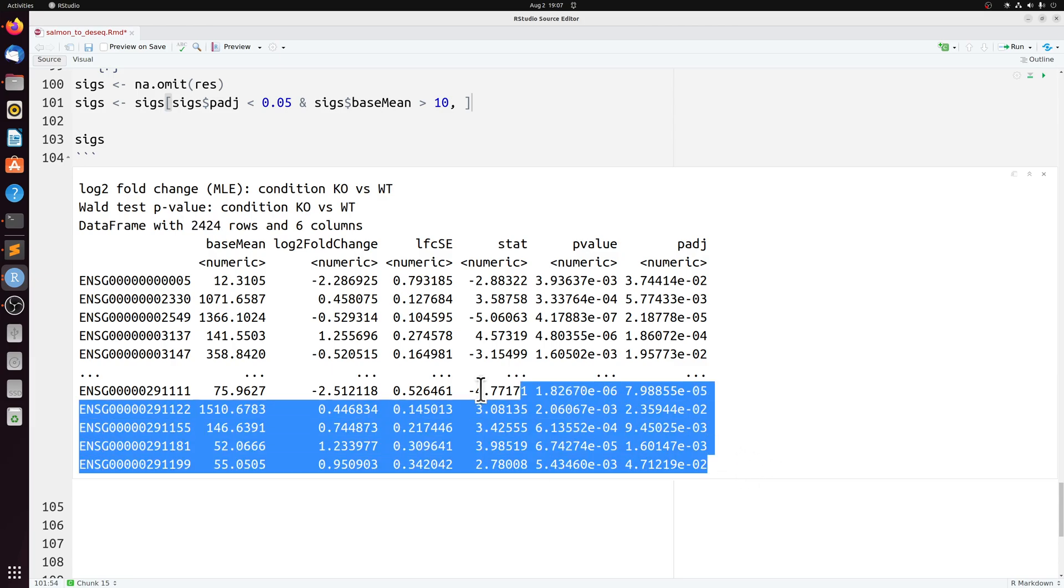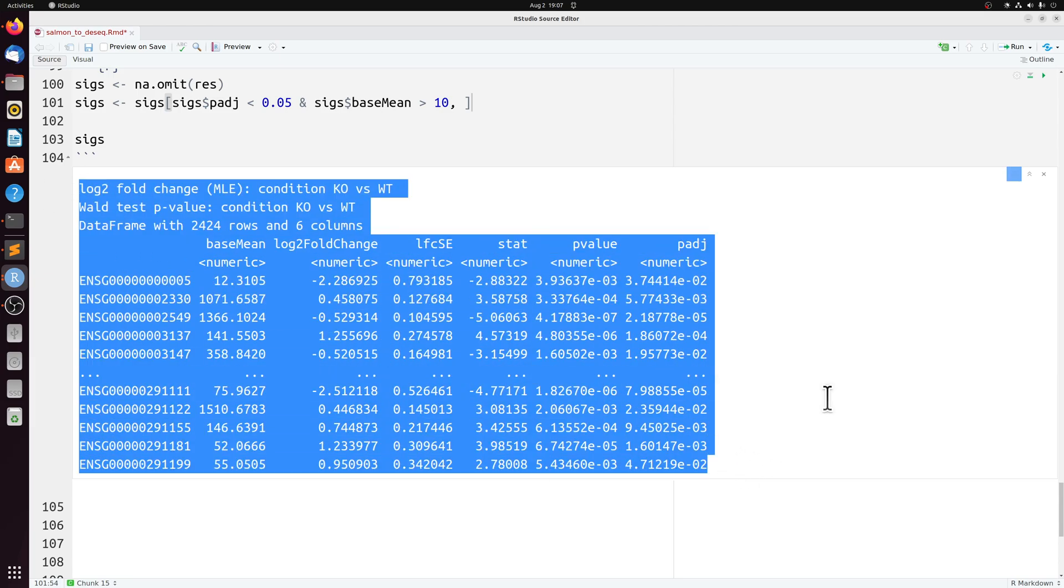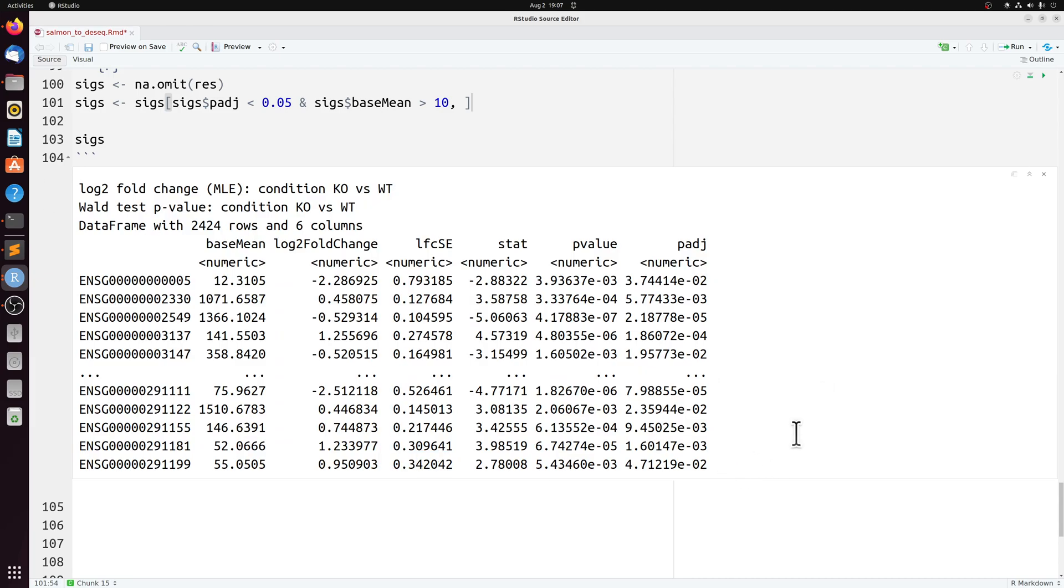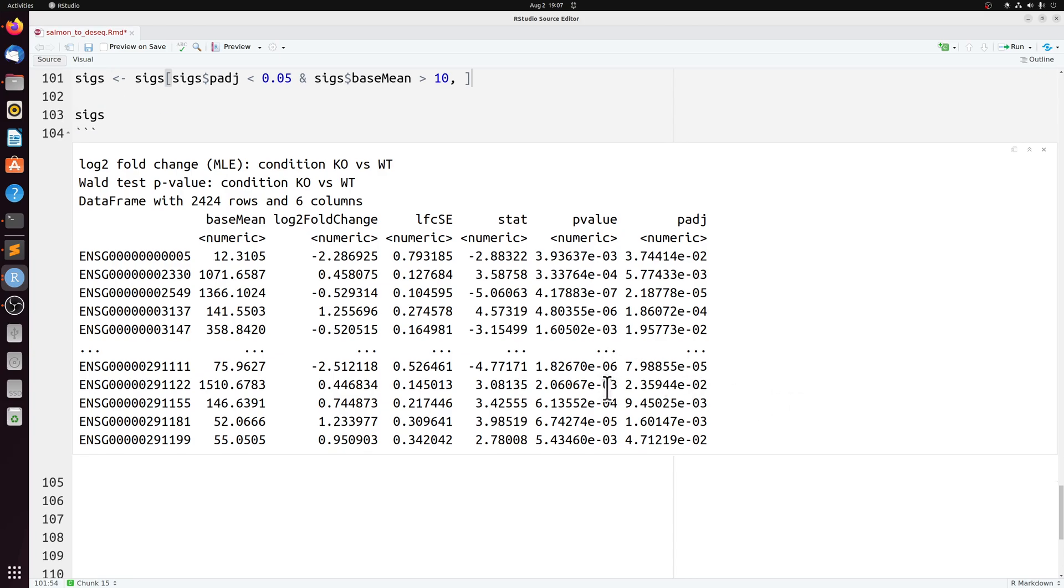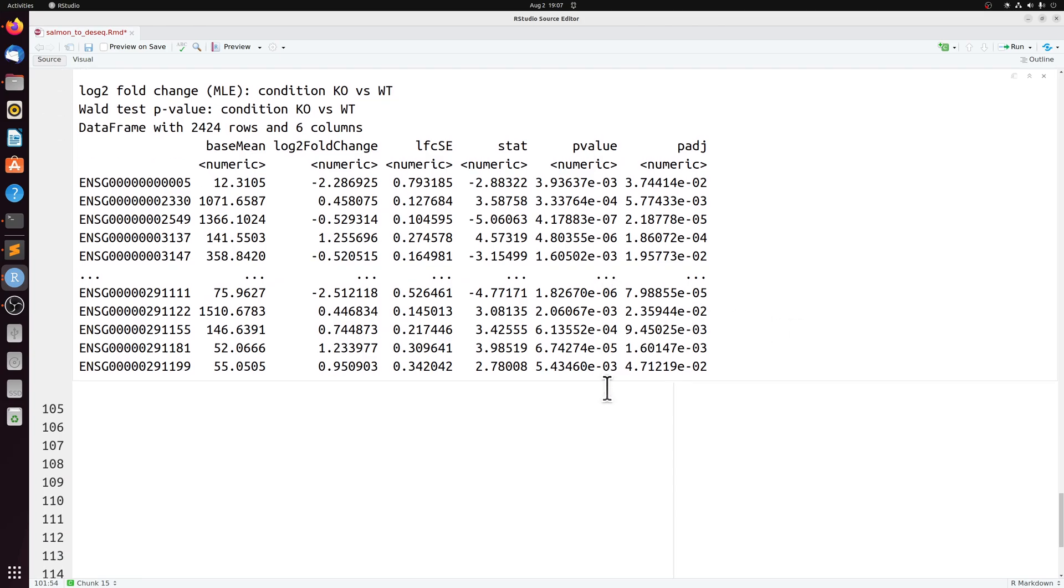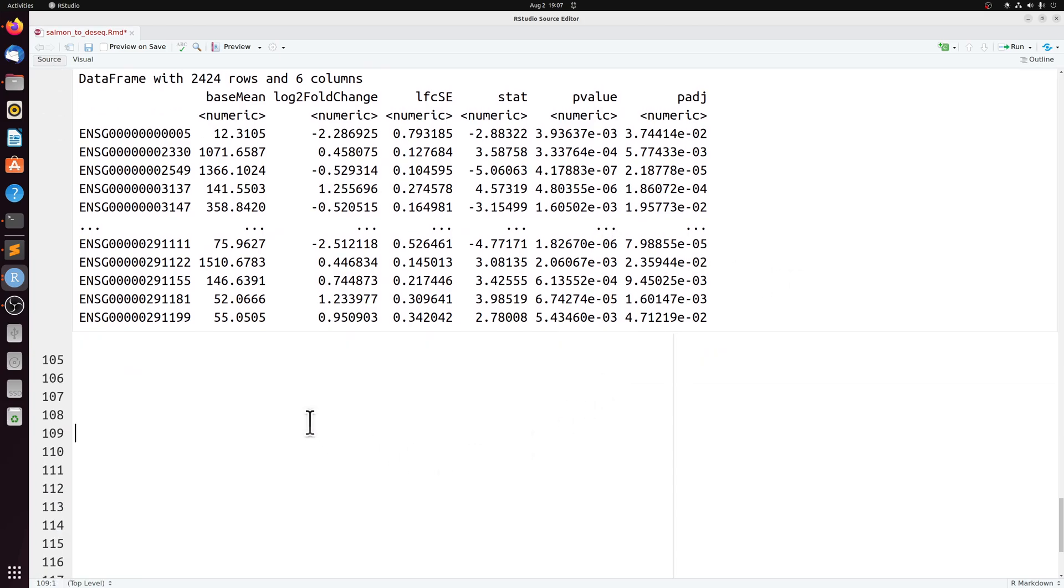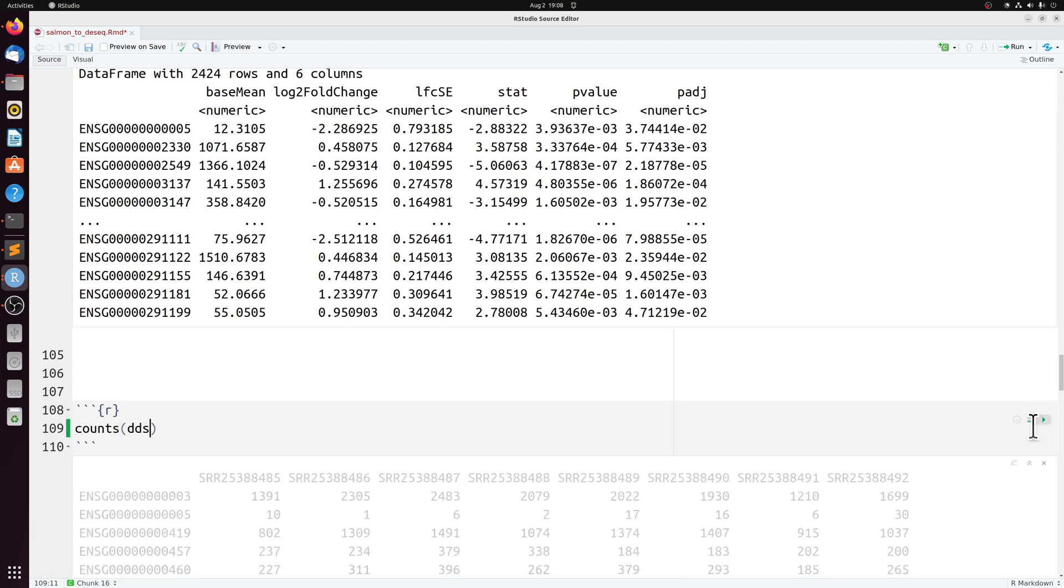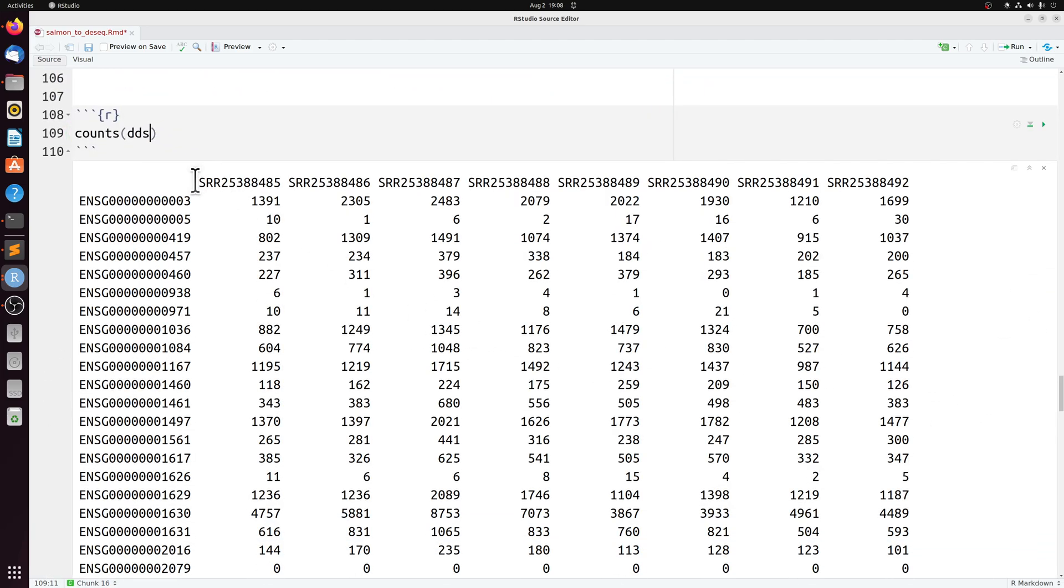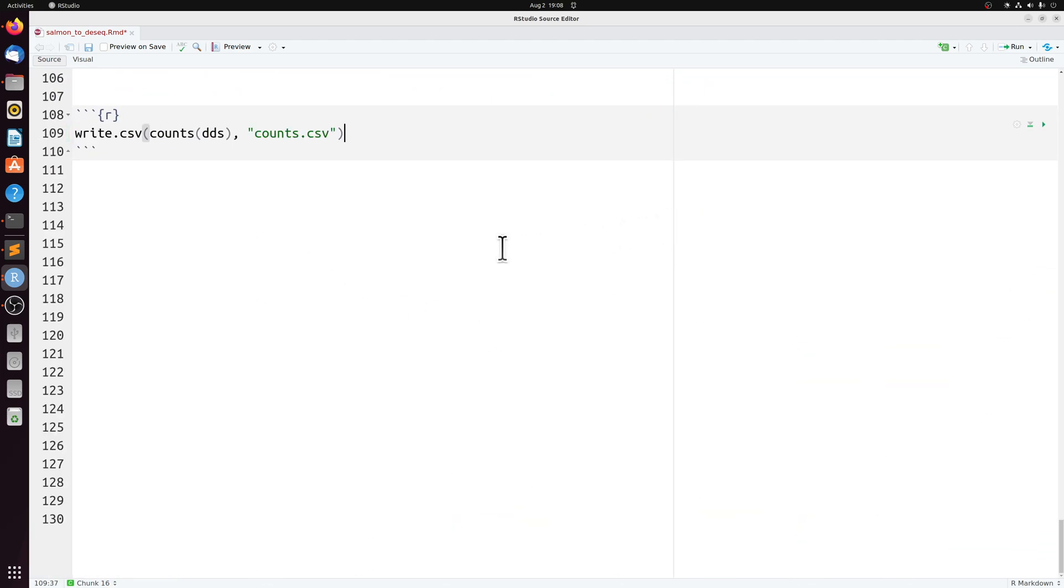But this is how we start with raw FASTQ files and in the end get counts from salmon and import that into DESeq2. And the one thing I didn't point out here is you can actually just export the counts. If you don't want to use DESeq2, you can just write this as a CSV.